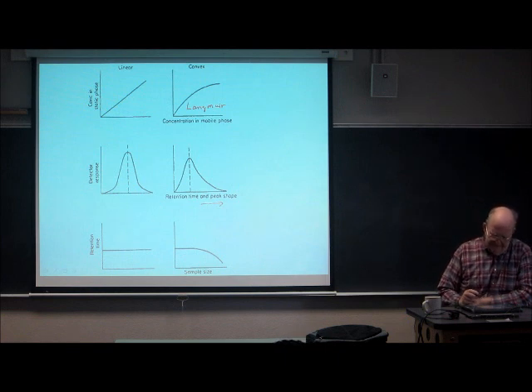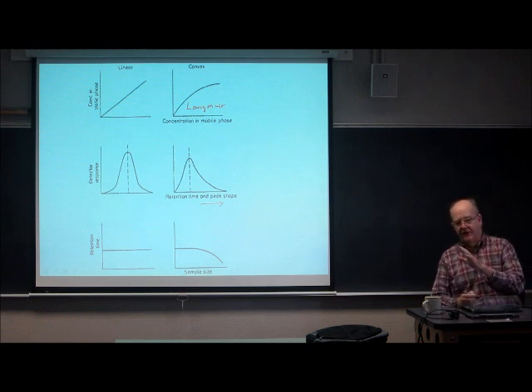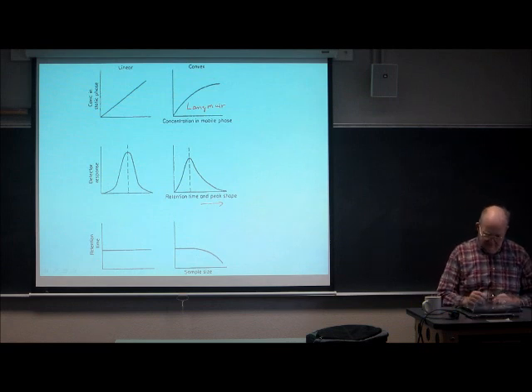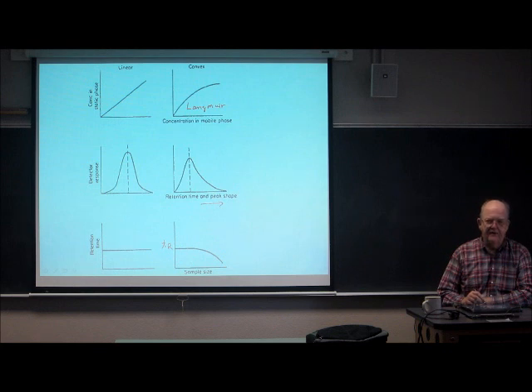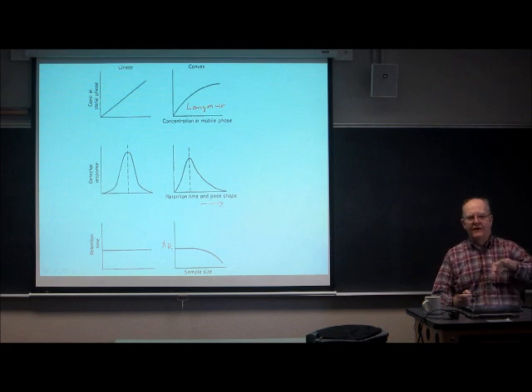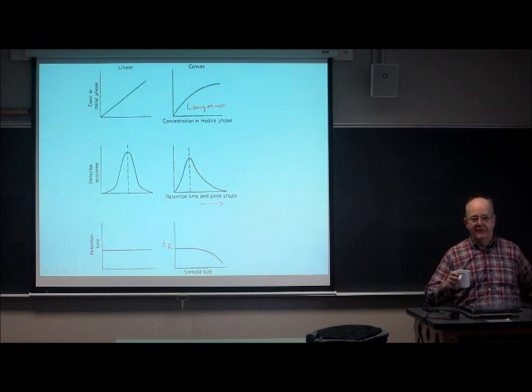What you will find in this instance is that if you inject a lot of stuff, the retention time, the position of the peak maximum, is going to drop. So this is your retention time here, and if you inject a little bit of stuff, it's constant, but you can inject too much and it starts to come down, and the more you inject, the more that peak moves in, until eventually it'll move into the dead time of the column.